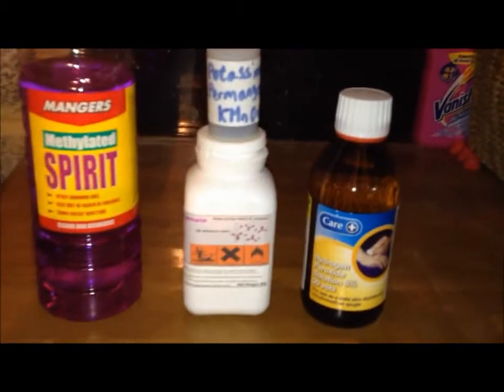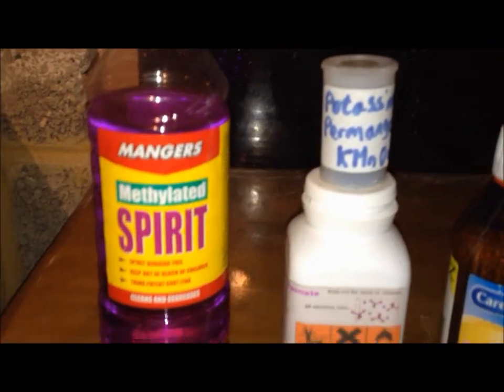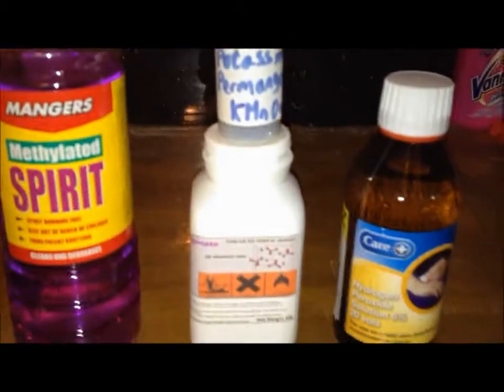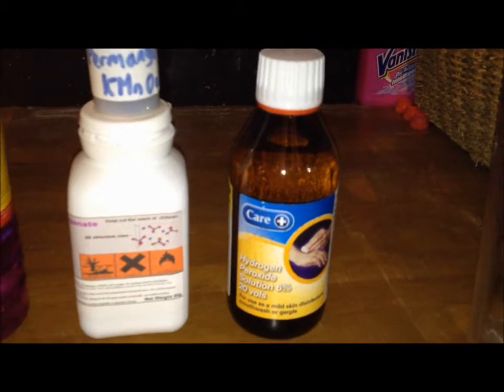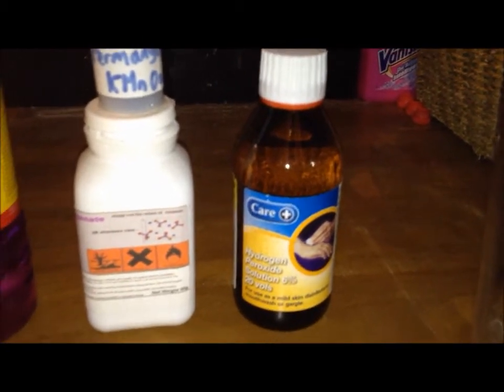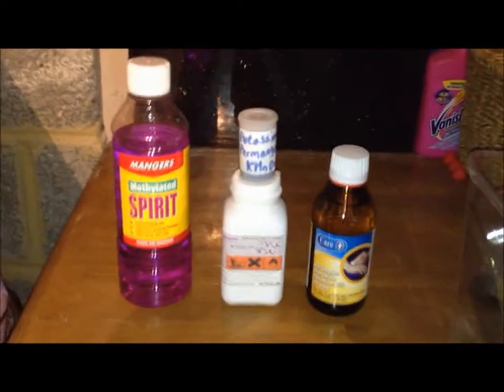Here we've got potassium permanganate, a pretty strong oxidant — stronger than hydrogen peroxide as you saw in my previous video. There's quite a lot in there, I think about 100 grams. I keep it in a film canister because it's a lot easier to work with. And then hydrogen peroxide — it's useful for a lot of reactions, a good source of oxygen, and not quite as strong as permanganate but still very useful.